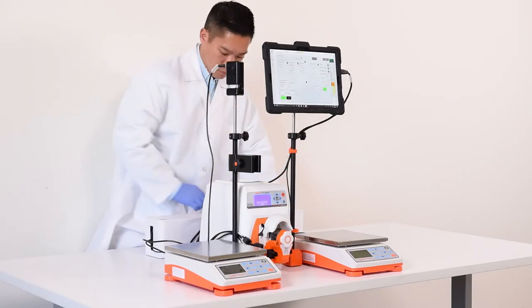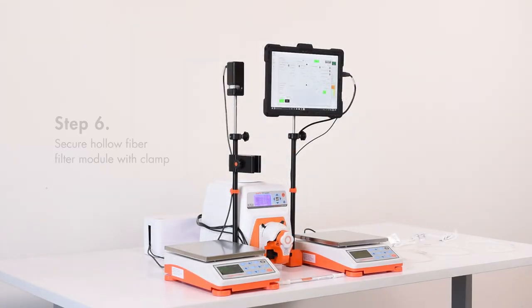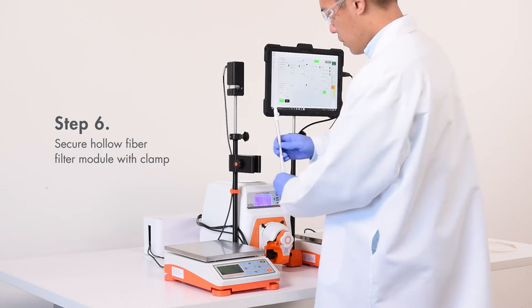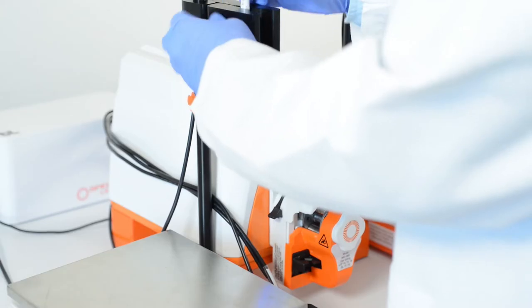After making all the proper connections, using the hollow fiber module clamp, secure the hollow fiber module to the stand. Tighten the clamp so that the module is secure.